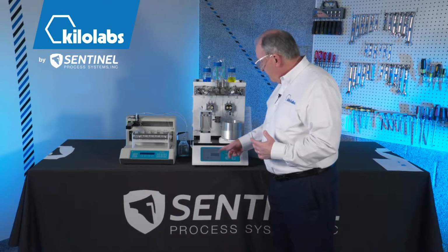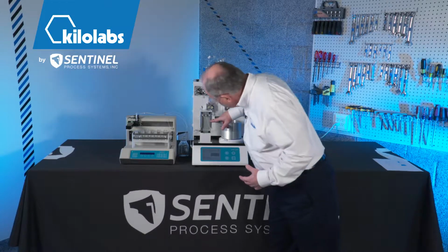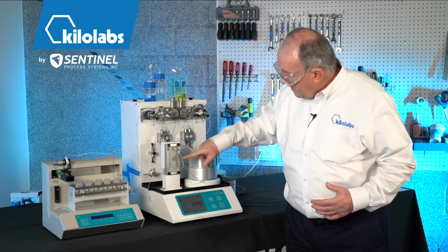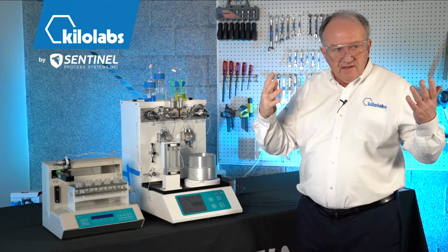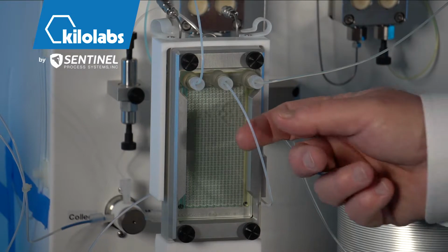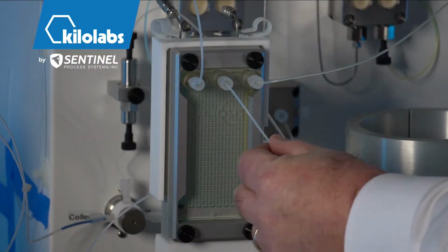The product now has reached the first chip, and you probably can't see that, but I can. There's a little bit of blue on the side and yellow on the left. This is food dye, so this is kindergarten chemistry, if you will. We're mixing blue and yellow to make green. And very slowly, it's going to come out. These are the 2 feeds coming into the side of the mixing chip, and this is the outlet of the chip.